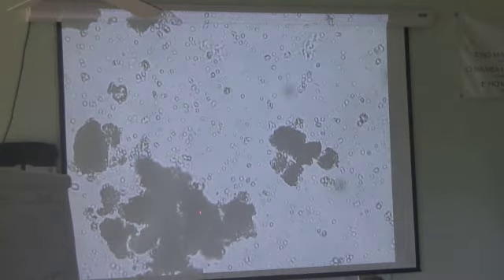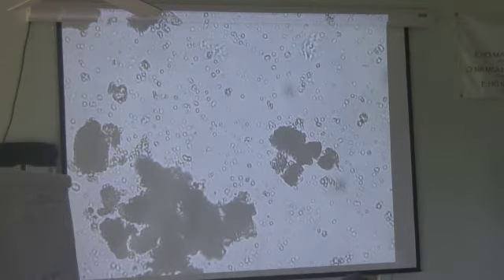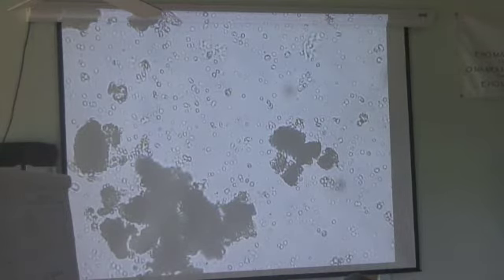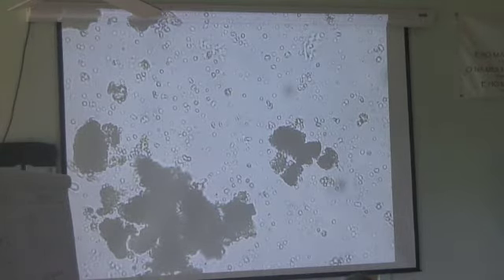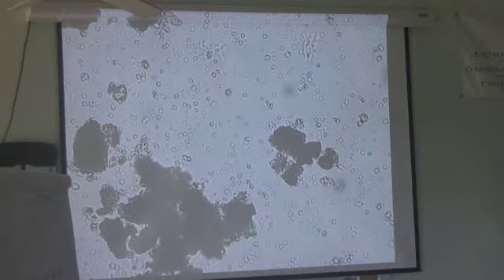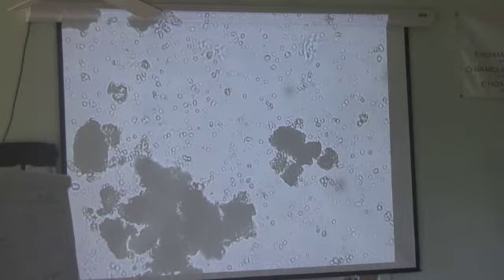Do you ever put drugs on your slide to slow the guys down? If I need to slow them down for some reason, I will take my slide off of my stage. I will flip my cigarette lighter, or light a candle or Bunsen burner, and you pass your slide through that flame like five or six times. And then put that slide right back on here. And you should be on the same field of view. And hopefully that critter is now slowed down. Because that was another flagellate to my own eyes.